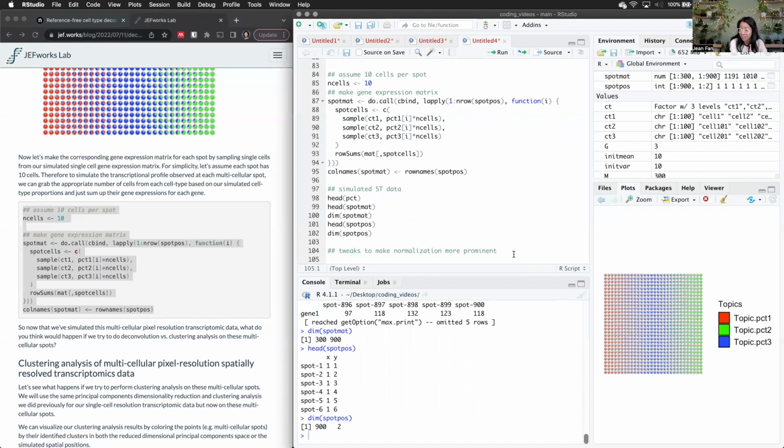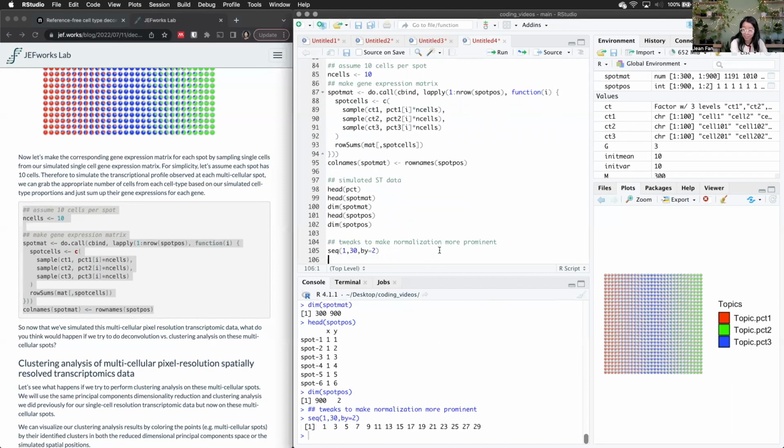So it's as if, let's pretend that I have 30 rows here. Let's say for some reason, every other row, I guess starting from the bottom, I will just make their library sizes way, way bigger. So it's as if I sequence these particular rows for some reason way more deeply. And so let's grab these rows.